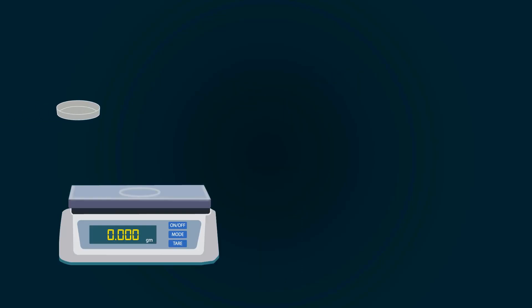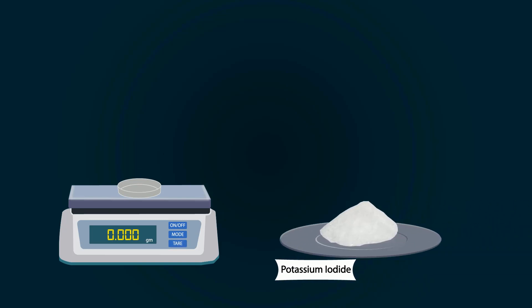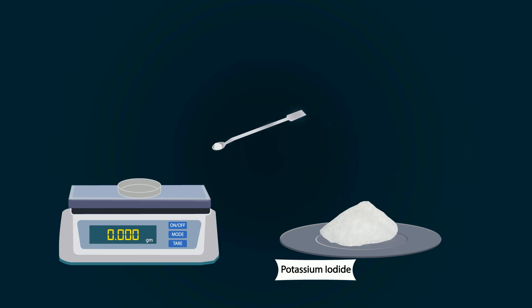Take another petri dish and put it on the weight balance. Tare the weight balance. Take potassium iodide chemical from stock bottle. Put potassium iodide into petri dish with a spatula. Weigh precisely 7 grams.